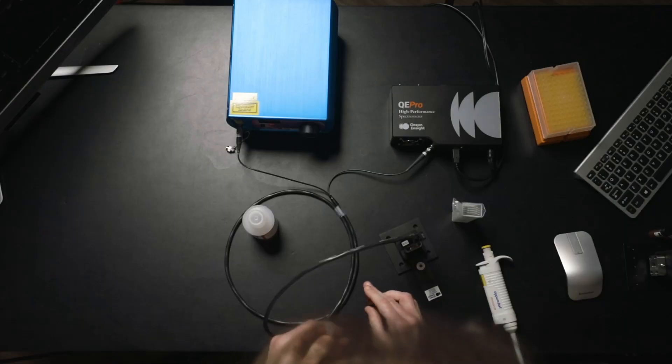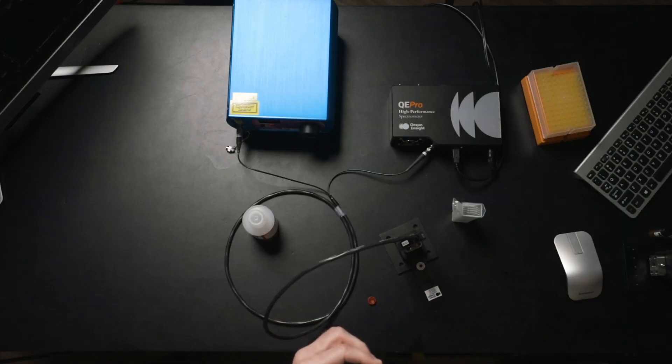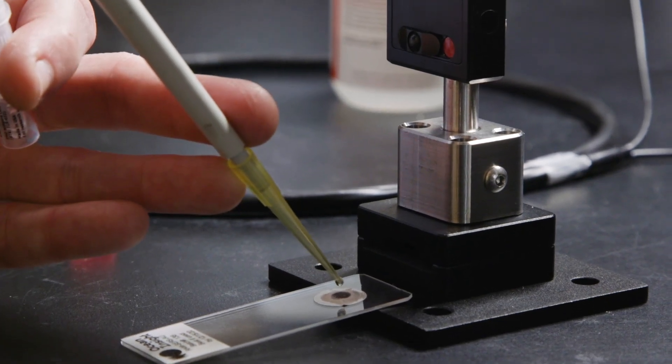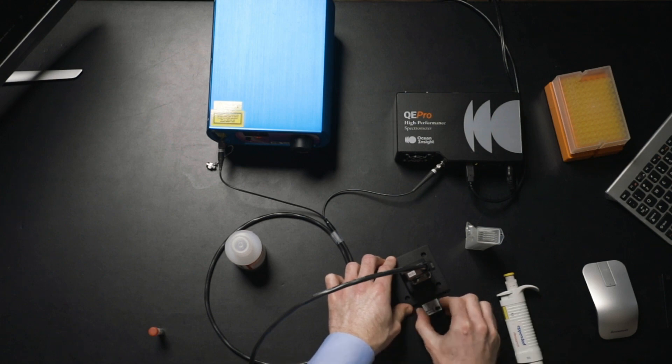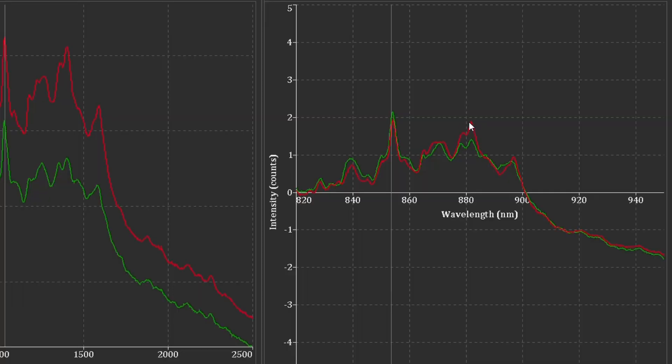Let's go ahead and apply some of our COVID antibody on there. We're going to take another five microliters and stick that right on the substrate. Now with this protein present, we're seeing relative to the original signal some depressions and some amplifications. The peaks present both before and after are inherent to proprietary components in these substrates that help with enhancement. We can see an amplification of the signal in this region and some depressions down in other regions.